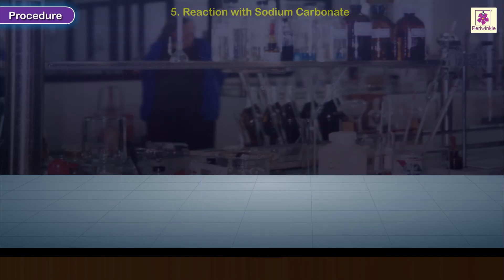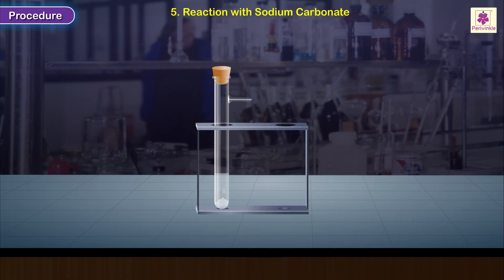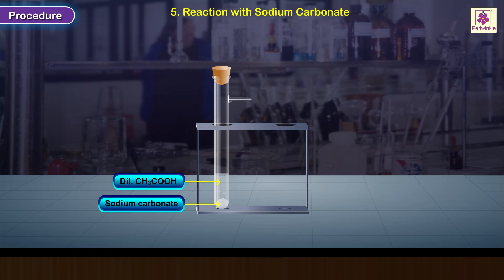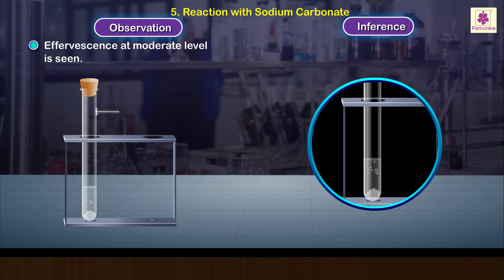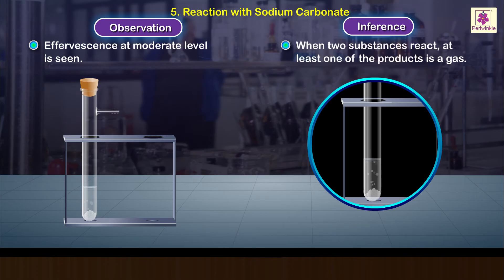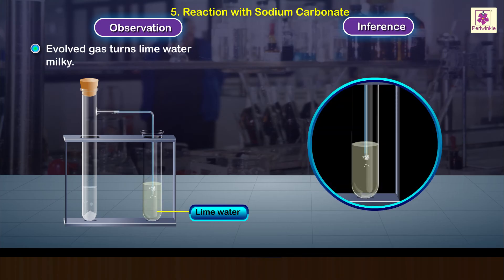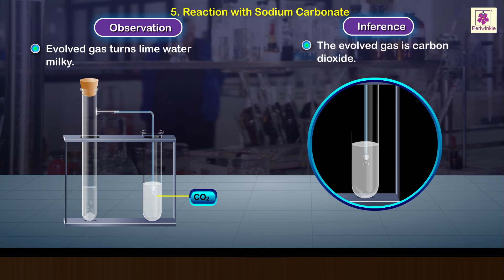Procedure 5 – Reaction with sodium carbonate: Repeat the earlier procedure using sodium carbonate instead of sodium hydrogen carbonate. Observation and inference: effervescence at a moderate level is seen; at least one of the products is a gas when ethanoic acid and sodium carbonate react. The evolved gas is carbon dioxide.